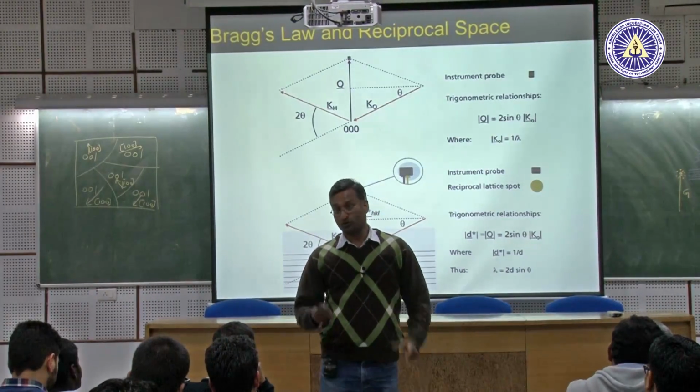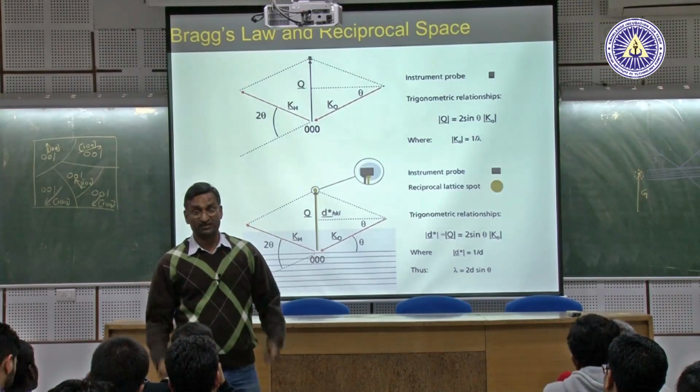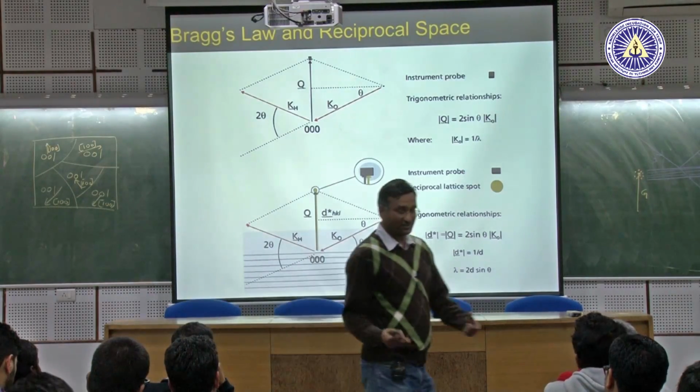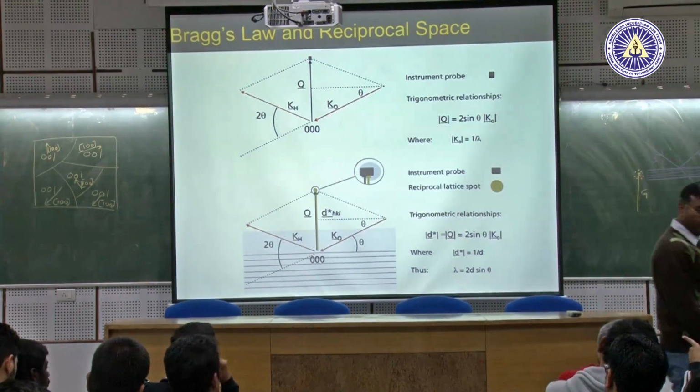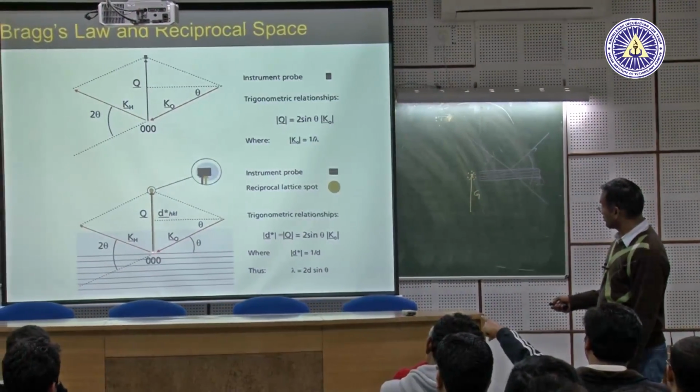Because you know that by changing the composition you change the lattice parameters, and by changing the strain you change the lattice parameter as well as the D spacing. So, their origin should not be, sorry? Origin must change in that case. So, this origin is the same.